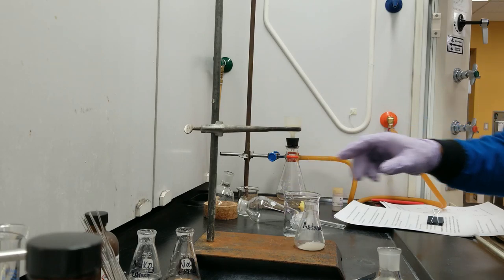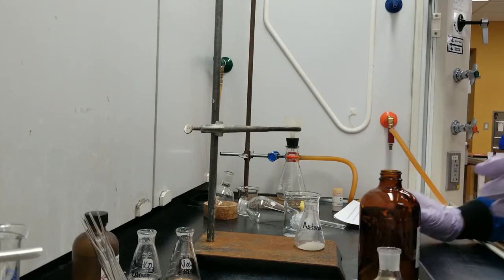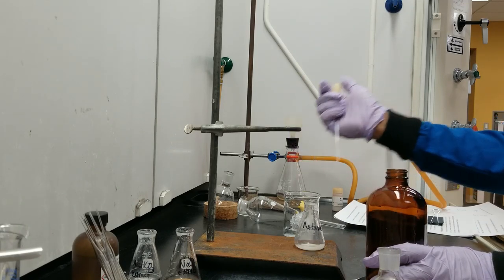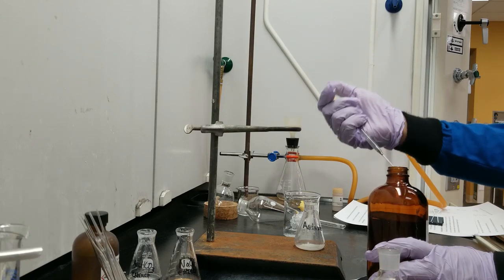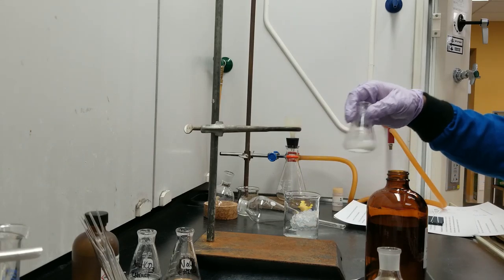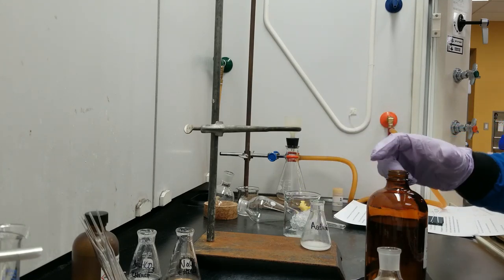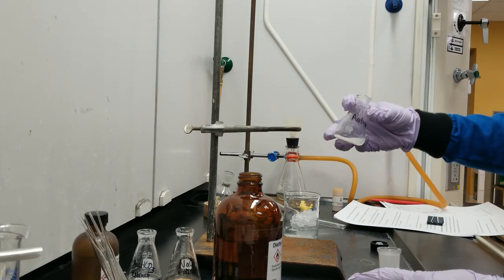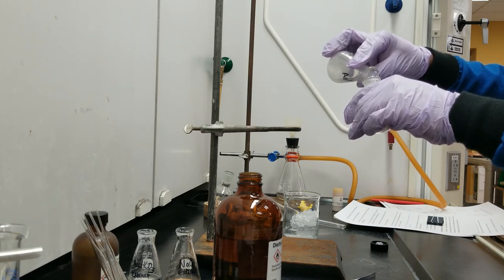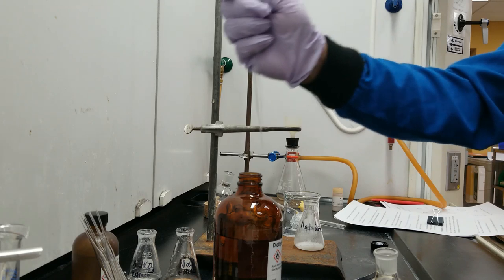Sodium sulfate with 5 mL of ether, which I like to do in portions, by the way. So I will add about 2 mL of diethyl ether into the acetanilide Erlenmeyer flask to wash the sodium sulfate and decant the liquid into the pre-tared 50 mL round bottom flask, and do it again.